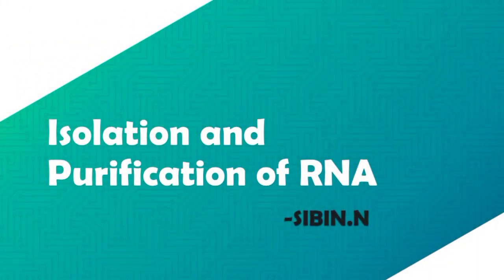My name is Sibin and today I am going to explain to you about isolation and purification of RNA.